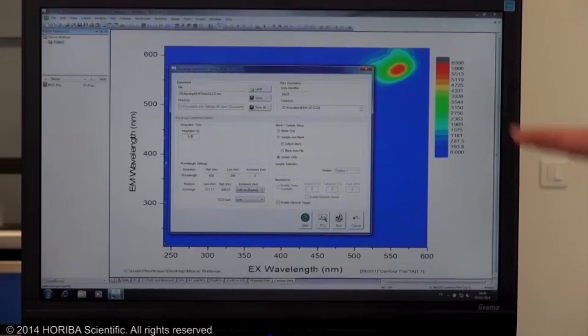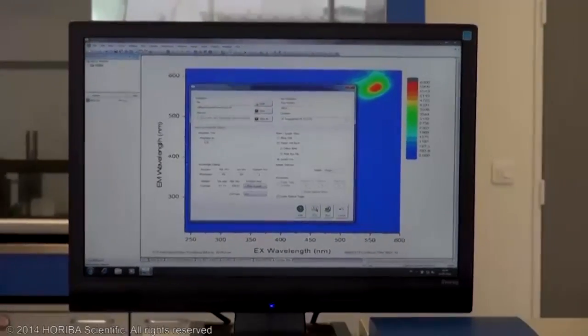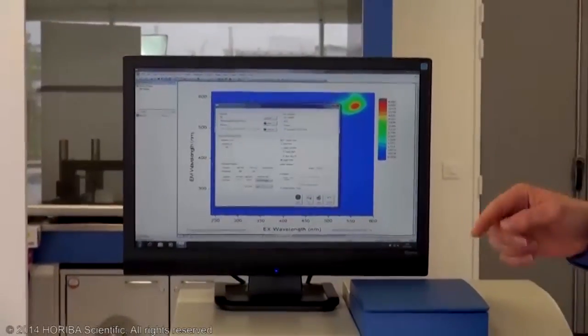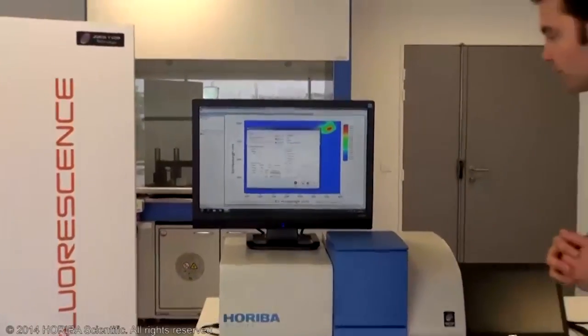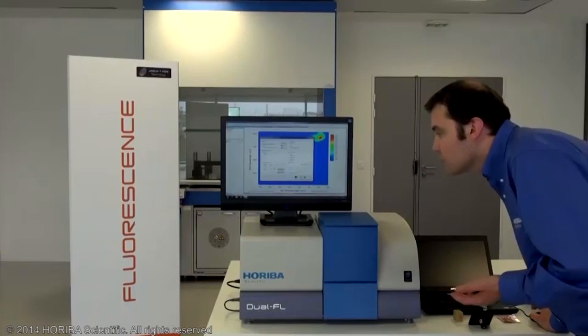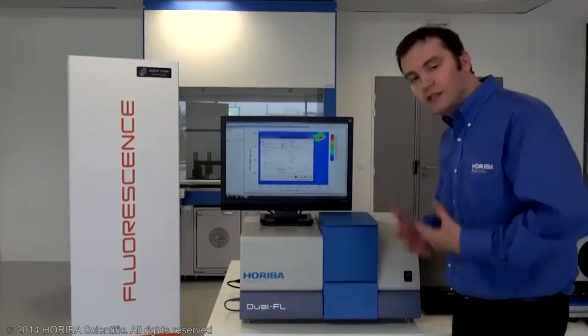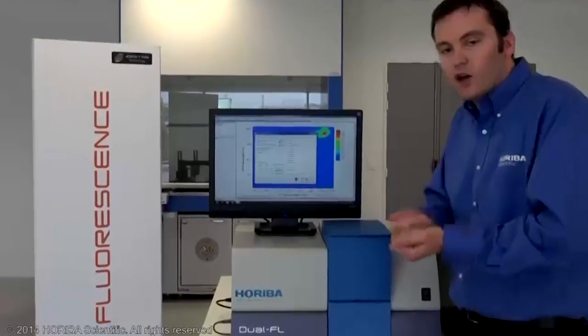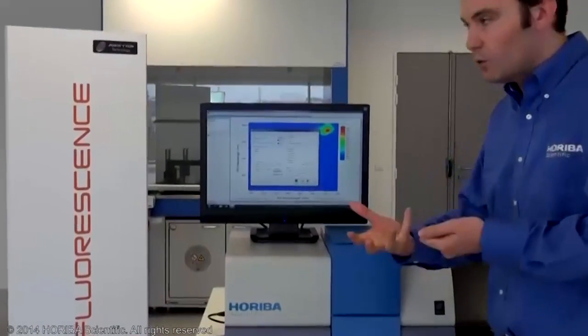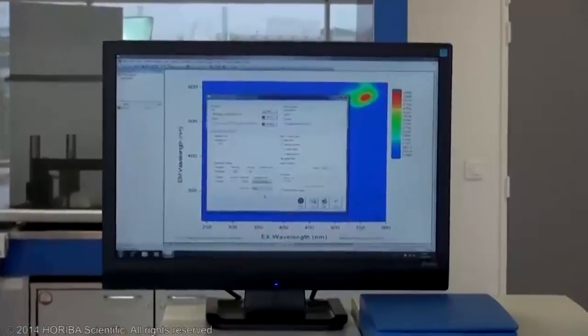So this time each spectrum, each record won't take 0.1 second, but 0.01 second, so we will be a little bit faster. Because of this, I need to modify some information for the CCD, which is the gain in that case, to recover the lack of signal that I'm going to get in terms of speed, to record enough photons at the end.